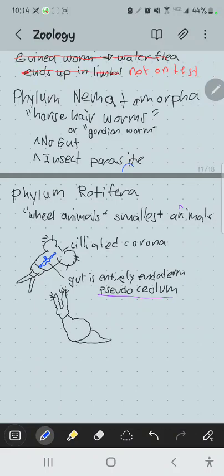So what to look at? Ascaris. We have our whole specimen, and you can look at the bottom here. Careful, this is formaldehyde that these are stored in. So if you want to look at this one, you can look at it from the bottom rather than opening that up. So you should look at the Ascaris. I'll probably ask you, you'll know it's Ascaris, it's labeled, but I'll ask you how you get infected and where it lives. You eat the eggs. It's in your intestines. Pinworms: scratch your bum, suck your thumb, it lives in your intestine.